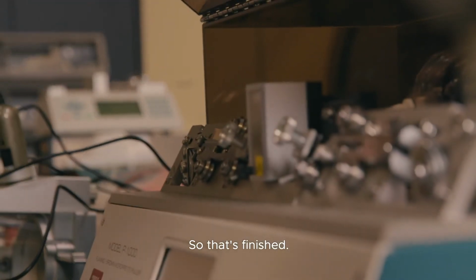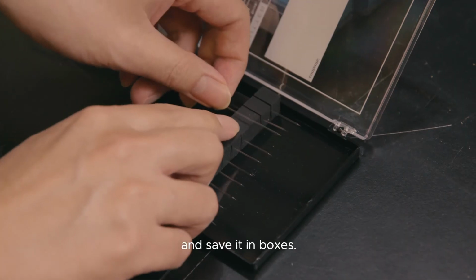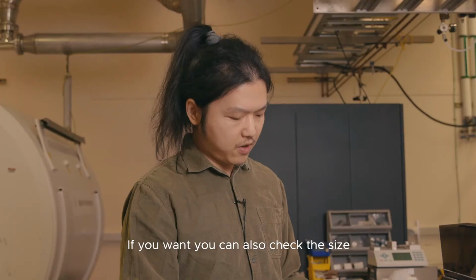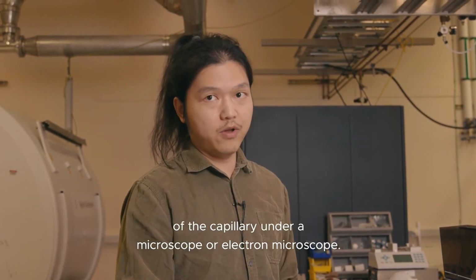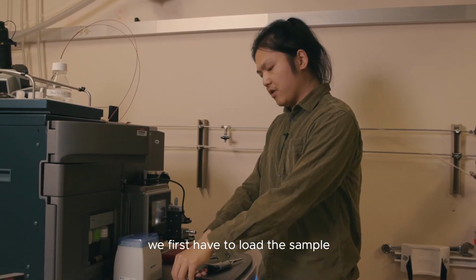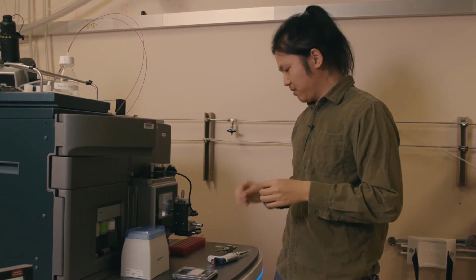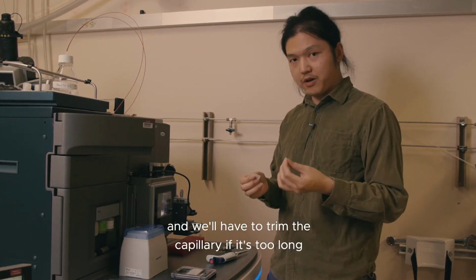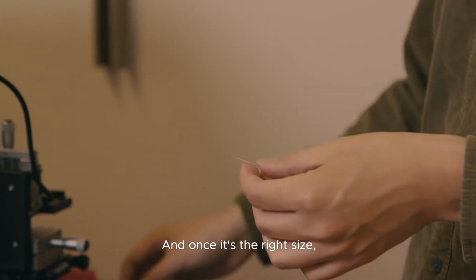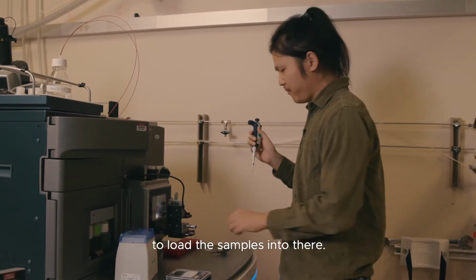Once that's finished, we can take the capillary out and save it in boxes for later use. If you want, you can also check the size of the capillary under a microscope or electron microscope. To start the experiment, we first have to load the sample into the glass capillaries we made. We trim the capillary if it's too long to fit on the instrument, and once it's the right size, we use these long gel loading tips to load the samples.